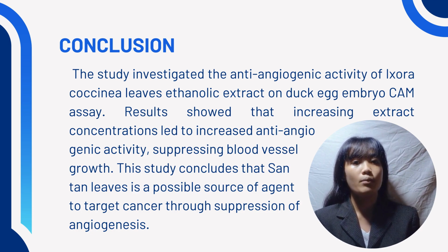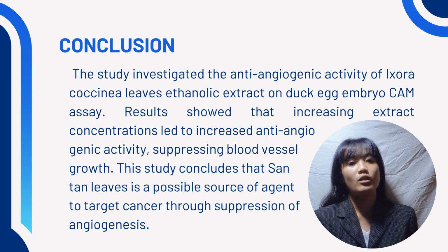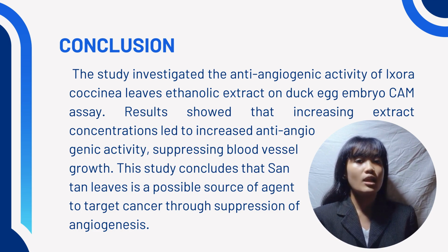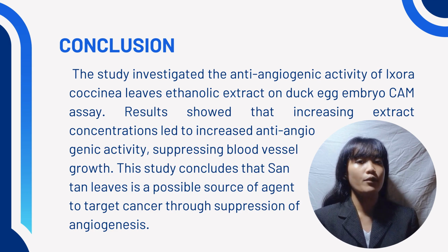Acquired from the statistical analysis, it additionally implies that as the Santan leaves ethanolic extract concentration increases, the ability of the extracts to suppress the growth of blood vessels also increases, corresponding with the study of Mia and others 2010, whereby the increase of concentration of Spondias gallianum extract is proportional to the increase of angiogenesis inhibition activity, albeit a small difference, while between the treatment groups and negative control, there exists a highly significant difference.